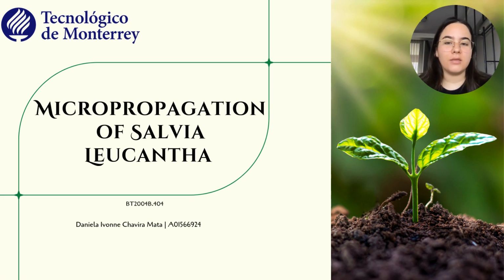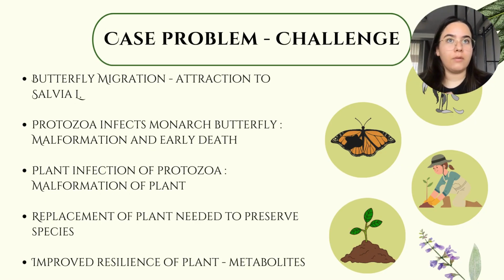Hi, my name is Daniela Chavira, and this is my evidence on the micropropagation of Salvia leucantha. We were to solve the problem of infection of protozoa in different plant species.